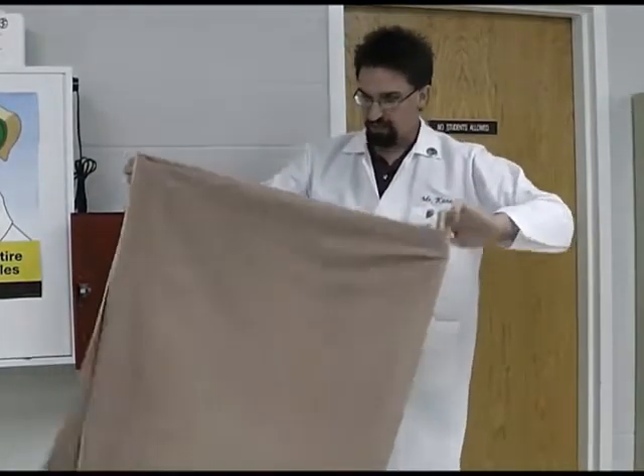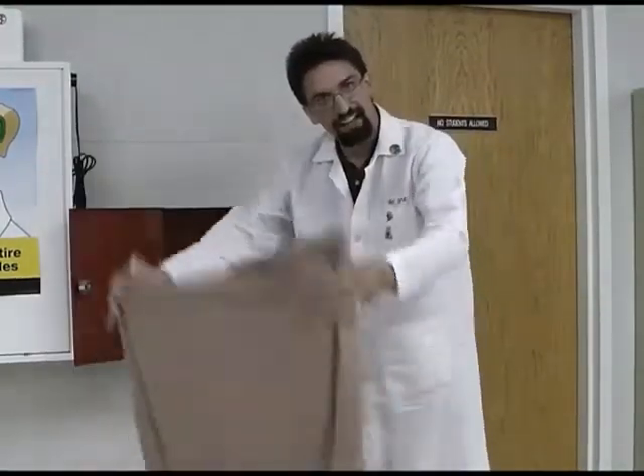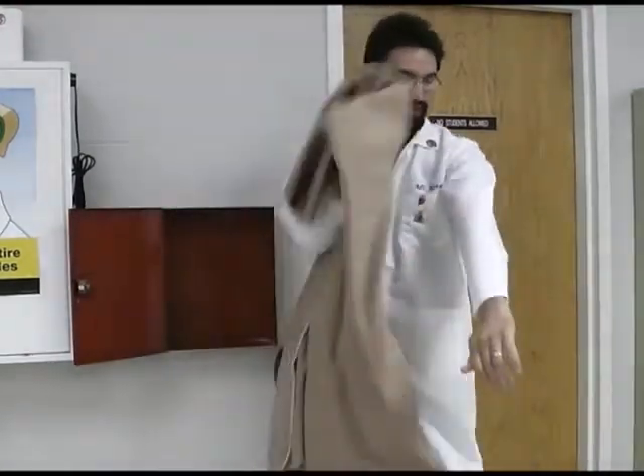If it comes down to it and you need the fire blanket, you just grab it out of here, and you do not fan the flames. You just place it over the body part that is burning and leave it there.